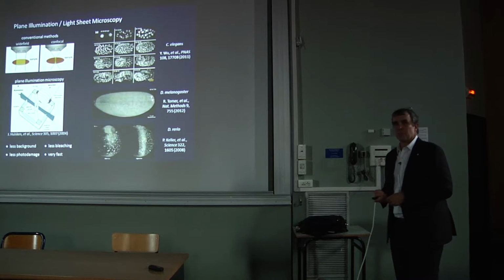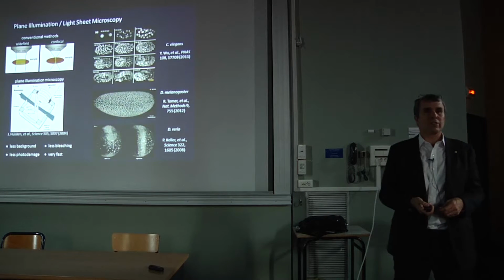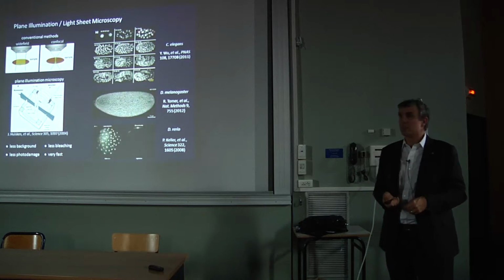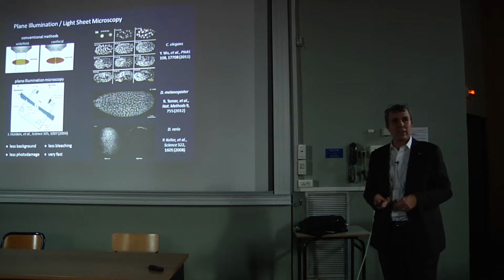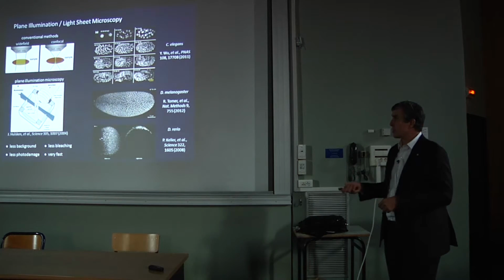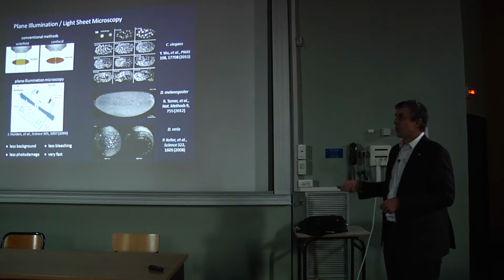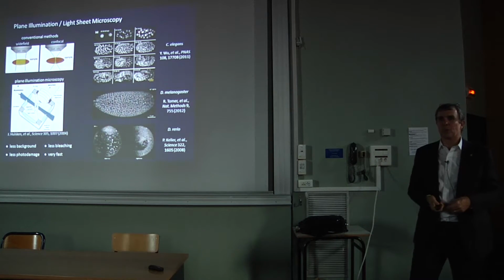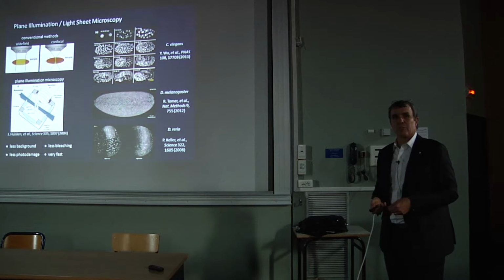In my opinion, one of the most important developments in microscopy in the last decade was when Ernst Stelzer at the EMBL reintroduced the 100-year-old idea of plane illumination. In this case, instead of bringing the excitation down through the same objective you collect with, you put a second lens at 90 degrees to the detection objective, in this case a cylindrical lens, and that creates a sheet of light which you then place coincident with the focal plane. Then the regions above and below are dark, and there's no damage, and there's no toxicity in those regions. There's no background from those regions.